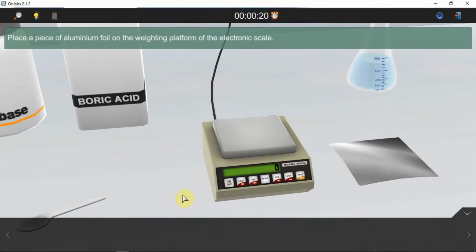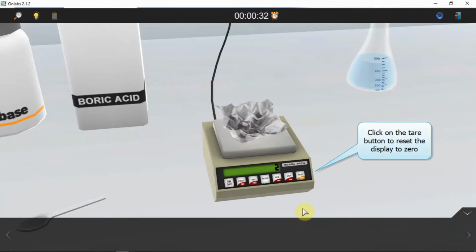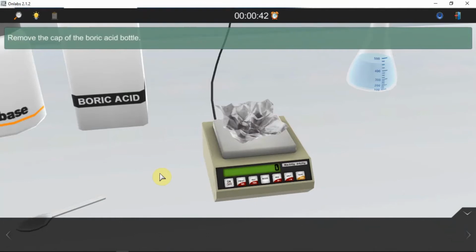Well done. Place a piece of aluminum foil on the weighing platform of the electronic scale. Well done. Reset the zero of the scale display. Well done. By pressing the tare button, the electronic scale will display only the weight of the powders placed on the aluminum foil. Remove the cap of the boric acid bottle.